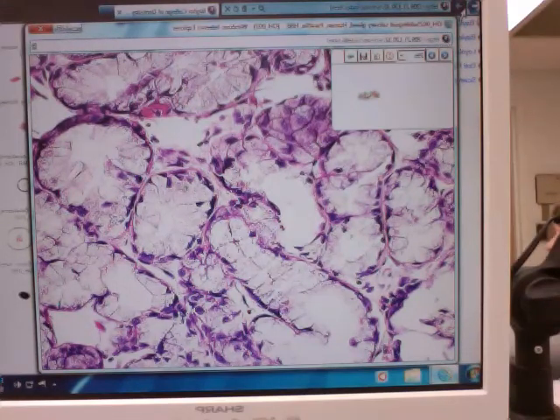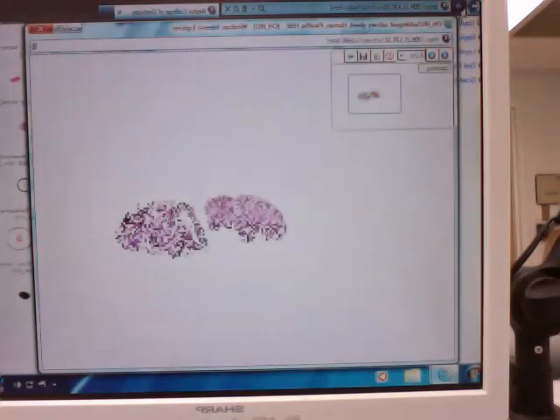Okay, so here you see individual cells. You can't see individual oil droplets in here. It's just this frothy material. This is a mucus gland. It typically stains purplish in nature. Here are the nuclei. So this whole thing is a secretory acinar unit. Each one is a secretory cell. And if it asks for what type, it would be a mucus gland, or maybe simple branched. I would just call it mucus. Mucus gland. Okay. All right.